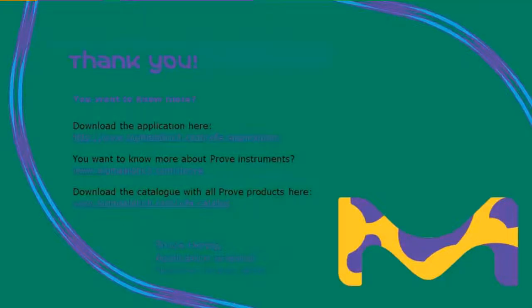Sure. This test is typically designed for aqueous solutions that contain silica. So it will work if the silica is in solution or could be put in solution. My understanding of industrial hygiene monitoring for silica dust is that it's typically captured on an airborne dust filter, and the measurement is typically done by X-ray diffraction. So that would be an application that would have to be developed internally here at Merck or by the customer.